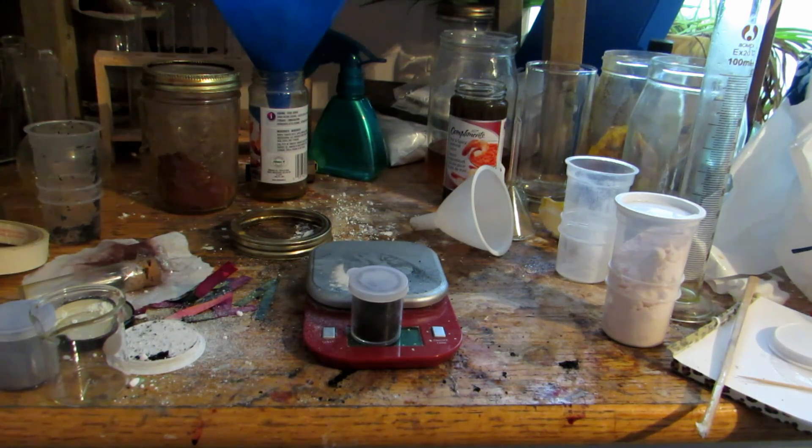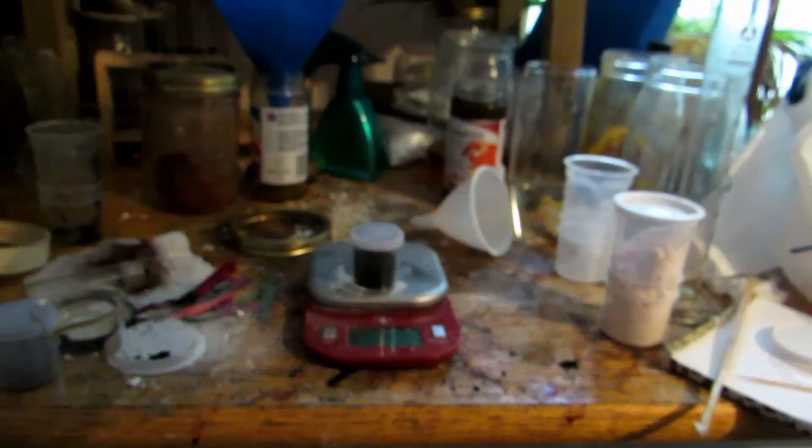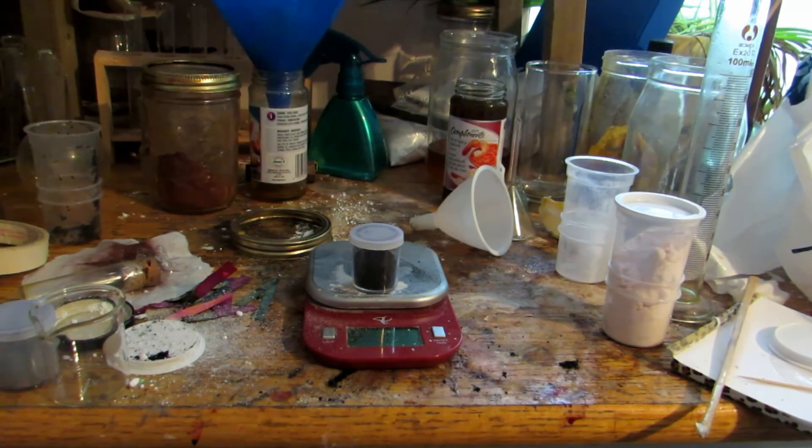So that's basically how to make carbon from sugar and sulfuric acid in a very interesting reaction. Hope you guys enjoyed. Bye.